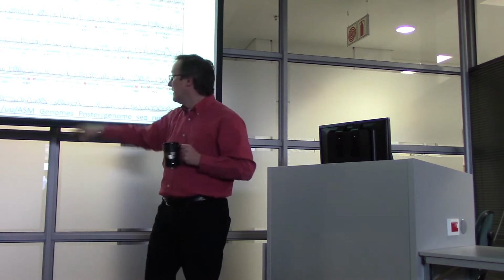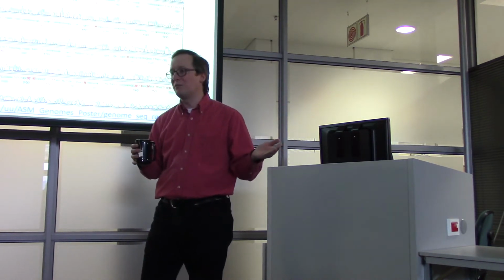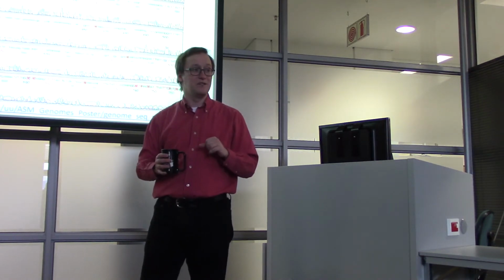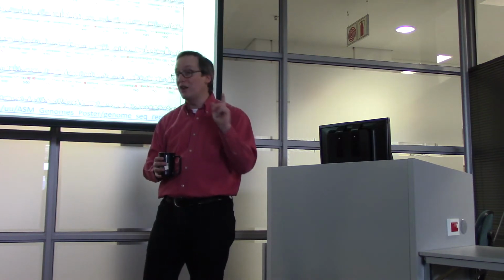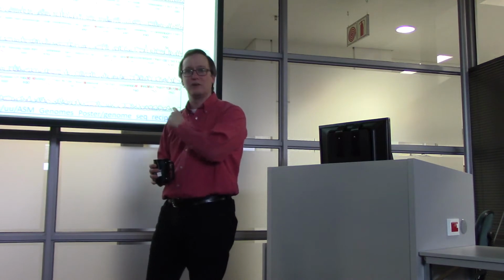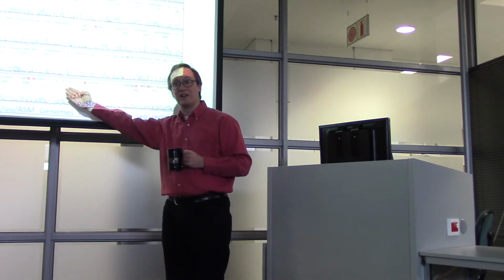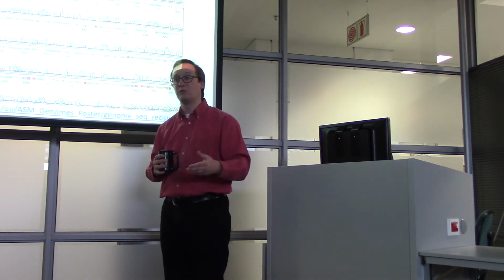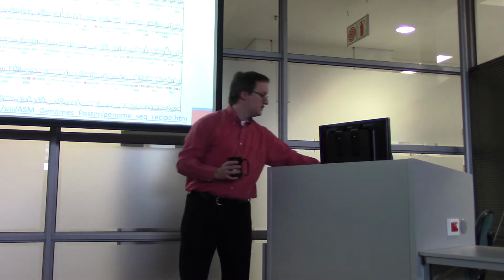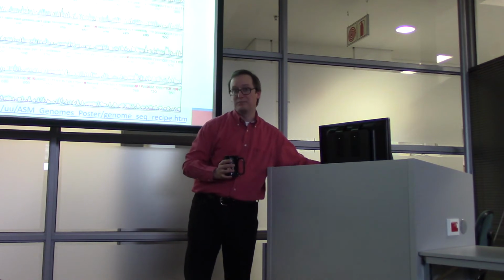If you were to keep an electropherogram for each of 1 million different 100 base paired reads, you would have a lot more information to store than just the sequencing reads. Now, those electropherograms are generated on the fly, but that information is not stored to an output file like this. So I can show you what an electropherogram from a Sanger looks like, but generally that information is not available when we run a sequencing experiment over on the MiSeq. Okay? So the same rules apply in both cases. These data I'm just using to illustrate the point.